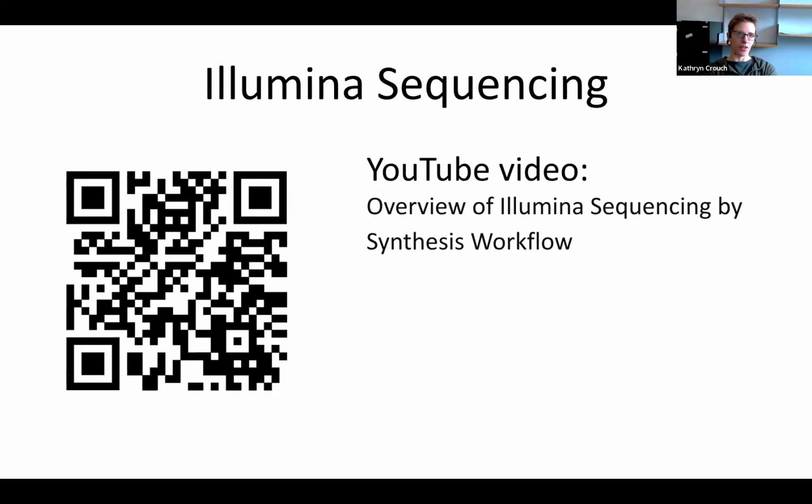Okay, so for the purposes of today, we're going to assume that you've taken your mature mRNA, turned it into double-stranded cDNA, it's been fragmented, and we're going to sequence that with Illumina sequencing. If I were doing this lecture in person, I would normally go through Illumina sequencing. It makes for a very long lecture.